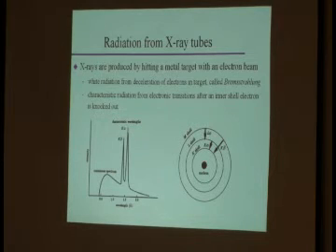And this little cartoon actually shows you how our radiation is named. If an electron is ejected from the K shell, and we have an electron drop down into the K shell, we certainly call that K something radiation. If it drops down from the closest neighboring shell, we call it K alpha. So that's an L to K transition. If an electron from the M shell falls down to the K shell, we call that K beta. So that is the second shell over from the K shell.